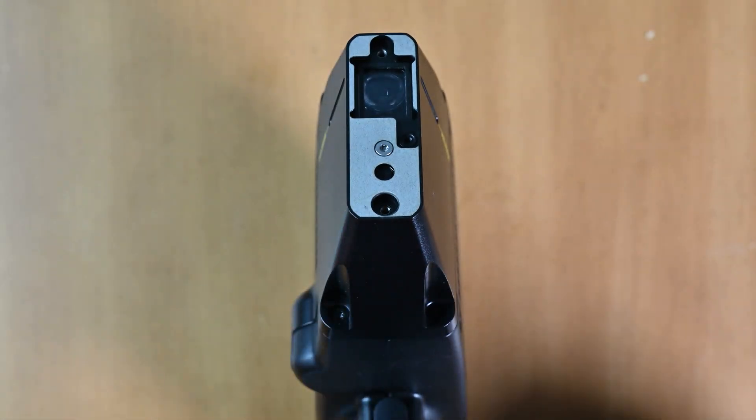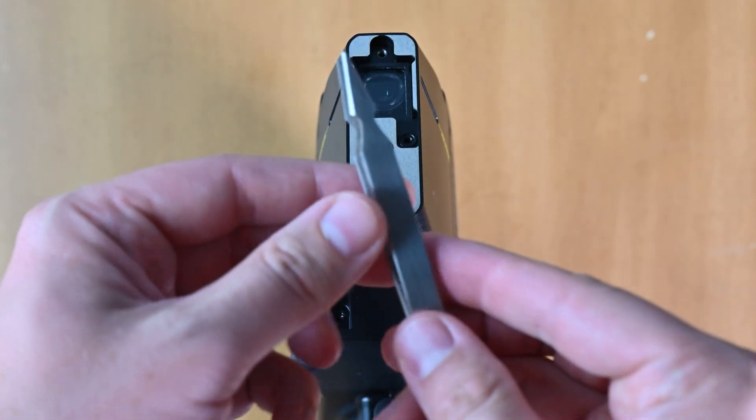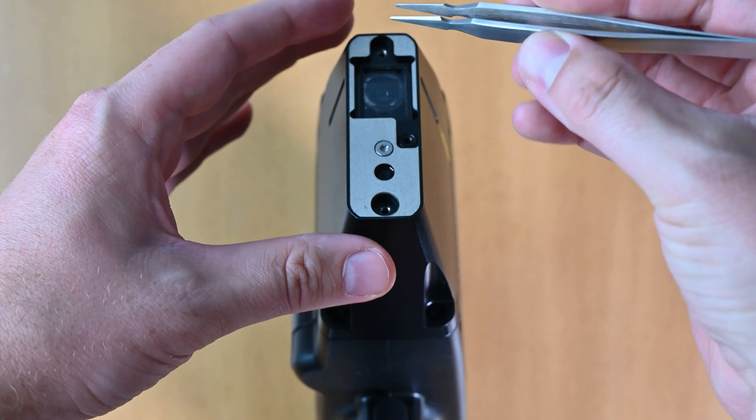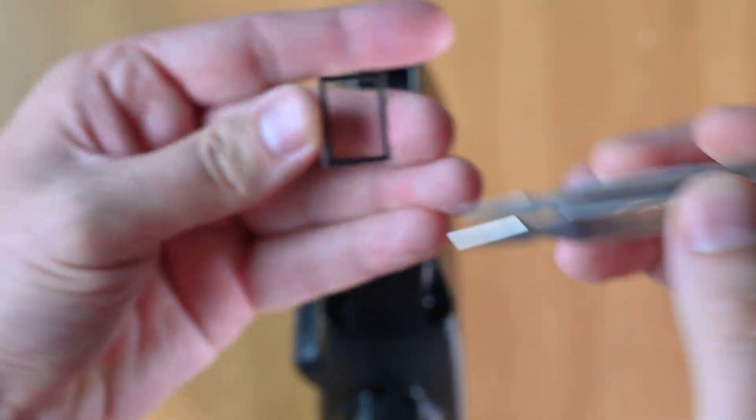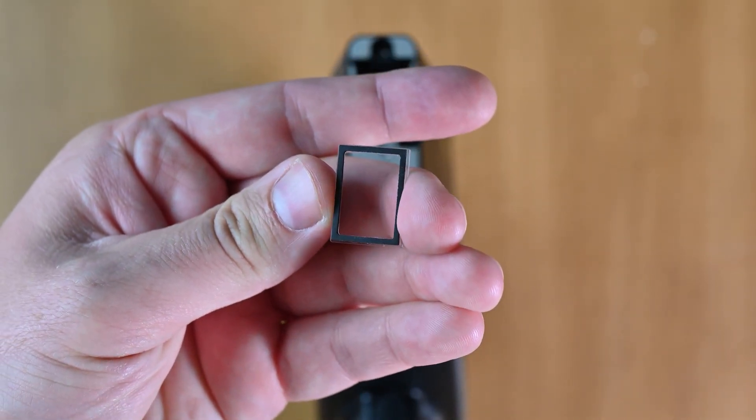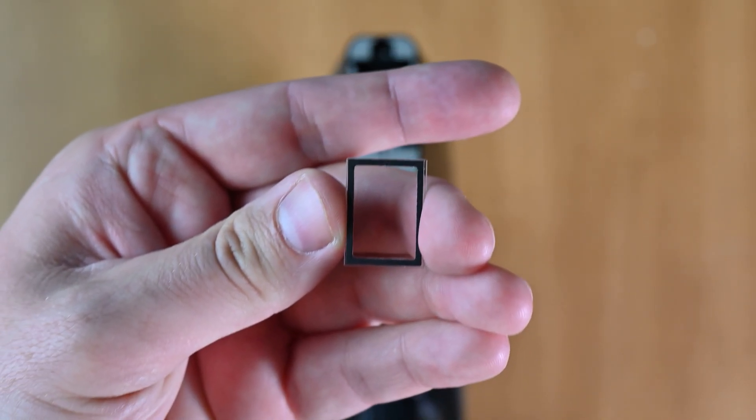So what we need to do inside of there is we need to take a tweezer like this one or a flat object and pry out this little shield here. This is called the blast shield. You should have a few spares in your kit.